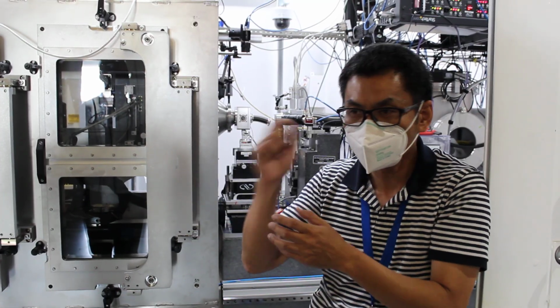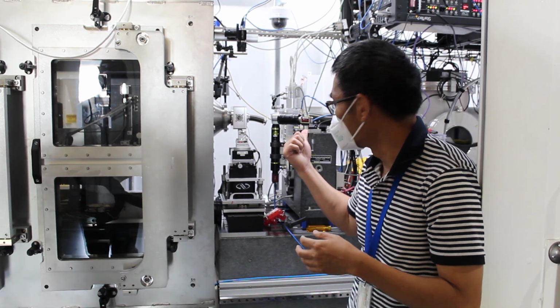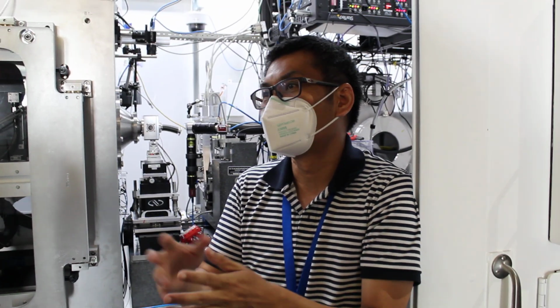Right. So that's one. Another thing we do here, which I'm actually setting up to do right now, is to look at biological tissues. Right now we look at a lot of plant tissues because they're relevant to the production of bioenergy.